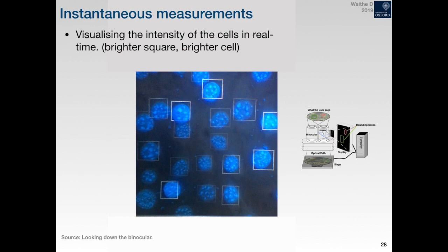So without too much training material, and obviously if it's very challenging data, if the cells are overlapping a lot and it's very variable cells, then you need more training data. But for cellular detection with DAPI or something like that, it's pretty much perfect. And from that point, you can do different things to sample more complex cells. So it's a great starting point, and we can do a lot with this, even if there's still some work to go with training on next to nothing, which a human can do, right? It doesn't take much for a human to recognize something.